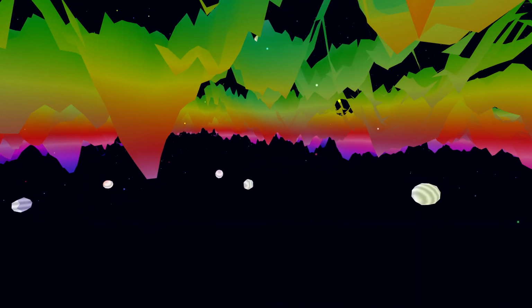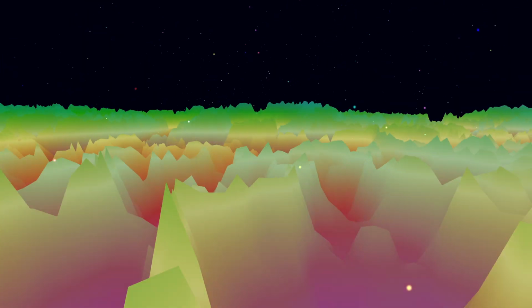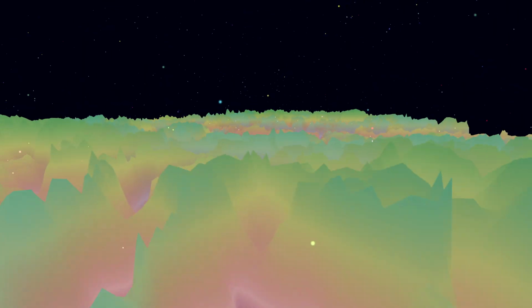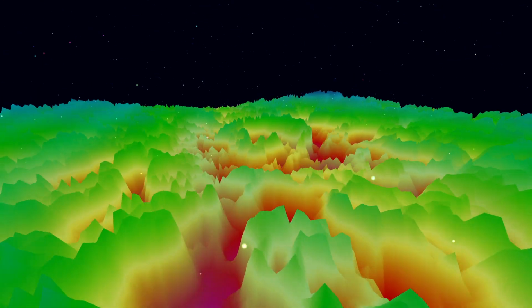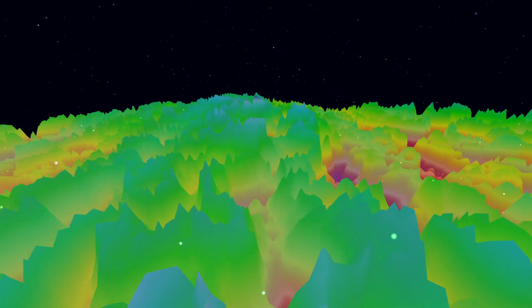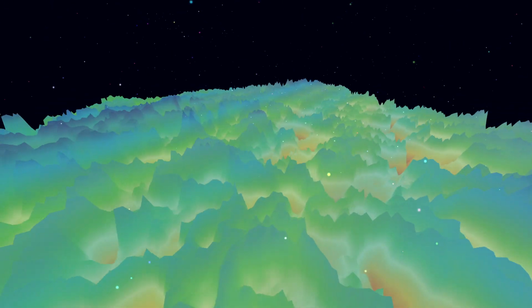Wow, okay. That's powerful. So XPS, X-ray photoelectron spectroscopy, that's where this really shines, right? Using X-rays. And it's the workhorse for this kind of analysis, yeah. XPS uses soft X-rays, typically from sources like aluminum K-alpha or magnesium K-alpha. They have enough energy to knock out those inner shell core-level electrons we were talking about. The ones deep inside the atom.